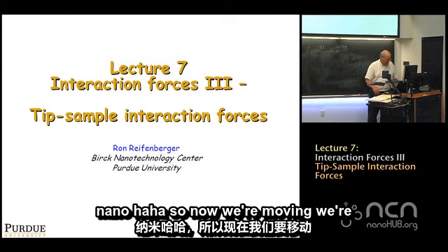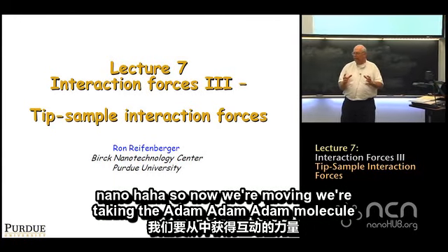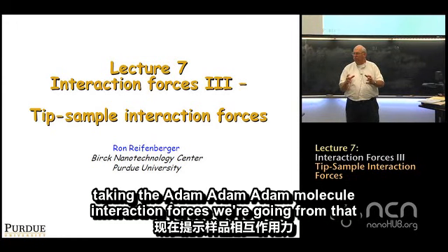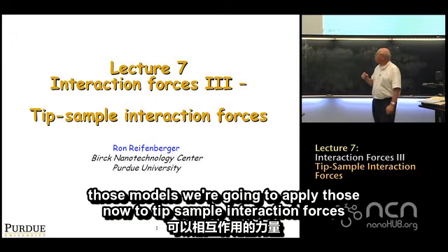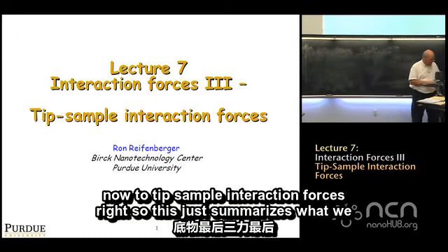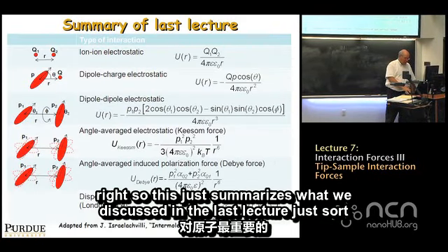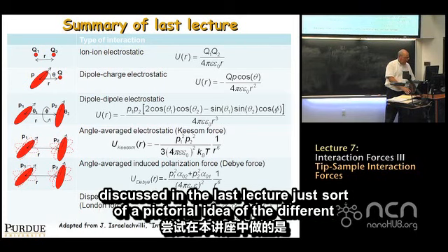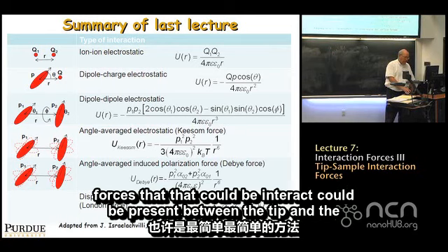So now we're taking the atom-molecule interaction forces, those models, and we're going to apply them to tip-sample interaction forces, right? This just summarizes what we discussed in the last lecture, just a pictorial idea of the different forces that could be present between the tip and the substrate.